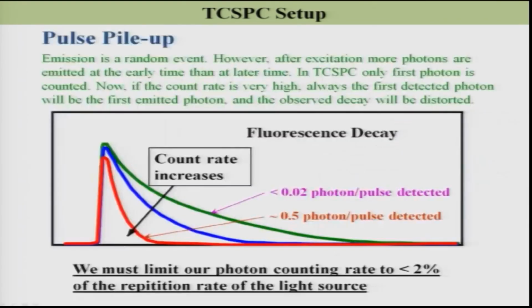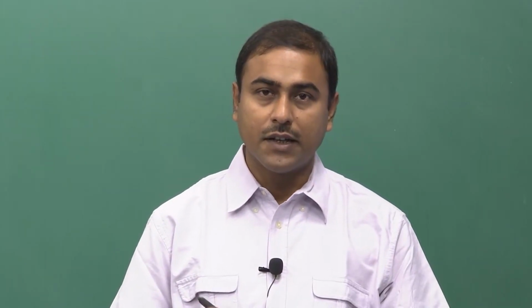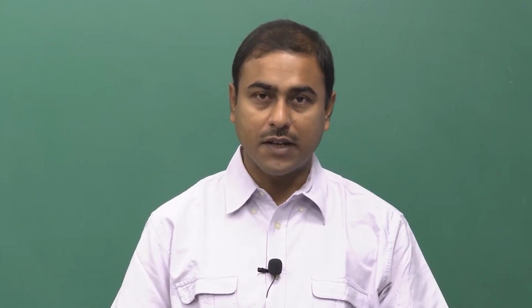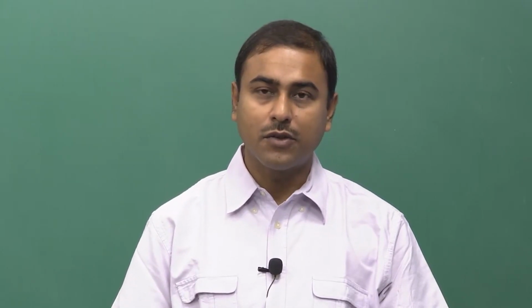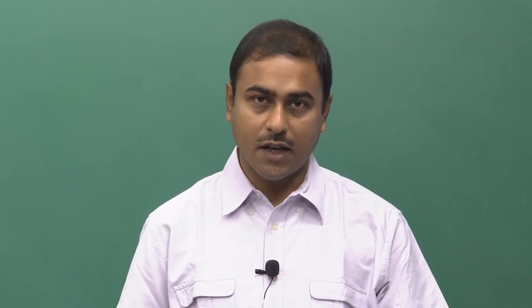Before moving to the instrument response function, let me tell you that the count rate of this TC-SPC system is very important. Why is it important? Because in TC-SPC the first detected photon is the most important photon. It means that for a normal sample where the lifetime is, let us say, about a nanosecond, the photons are emitted throughout the 5 nanosecond time window, as we have already seen.